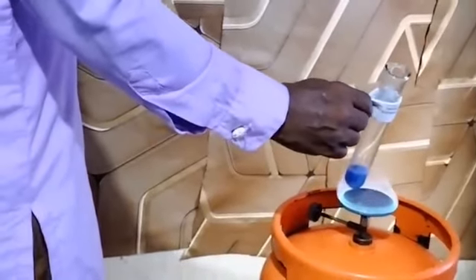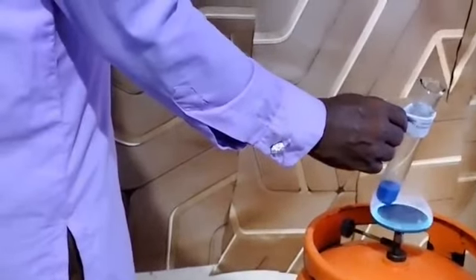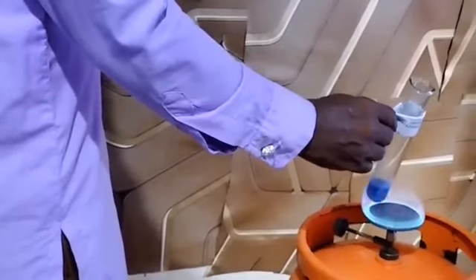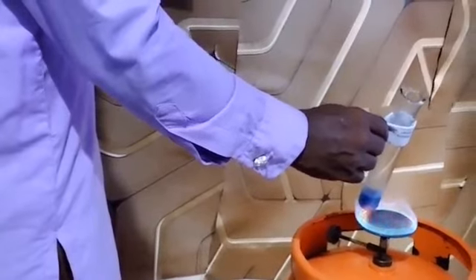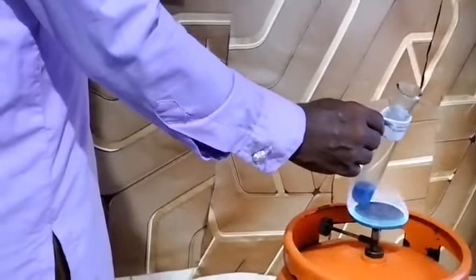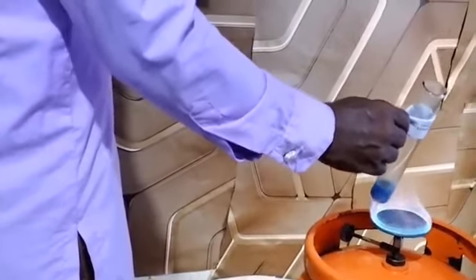So we started heating the mixture over the Bunsen burner. Heat until it boils and see whether there will be any change. When you heat, you try to rotate the mixture.